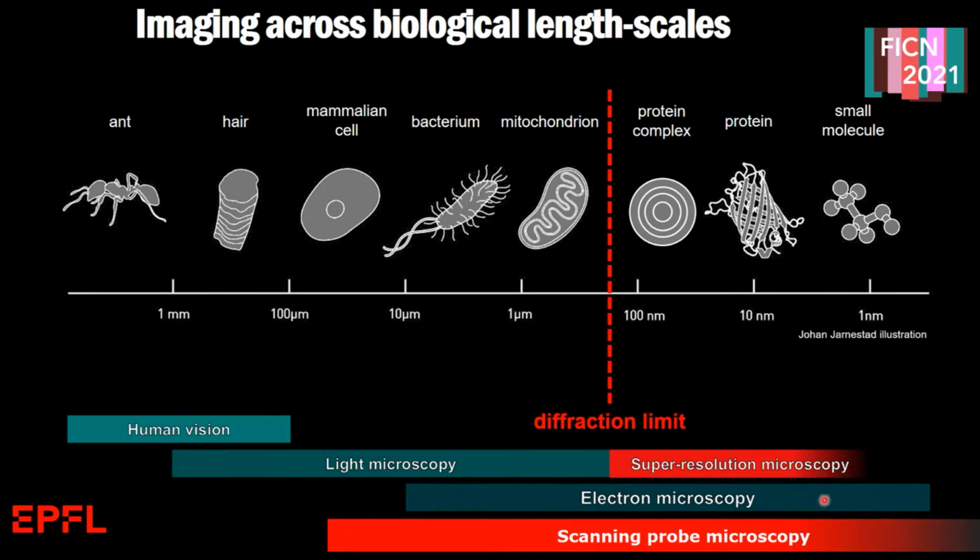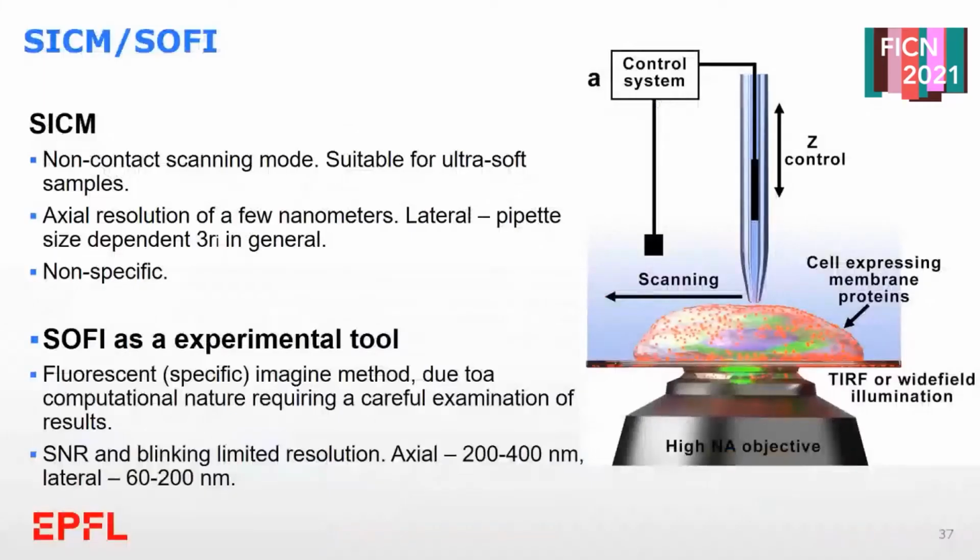One defining feature of scanning probe scanning ion conductance microscopy is that it uses a very tiny pipette and monitors the ionic flow through this pipette. Using the feedback, this scanning probe technique, if the feedback is regulated well, in principle never touches the cell. So it allows very long-term and very non-invasive measurements.